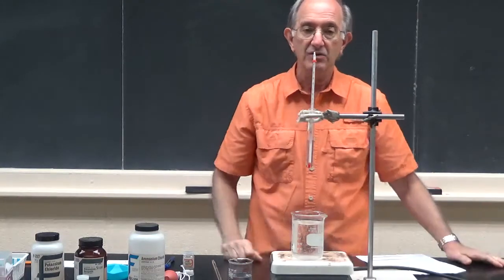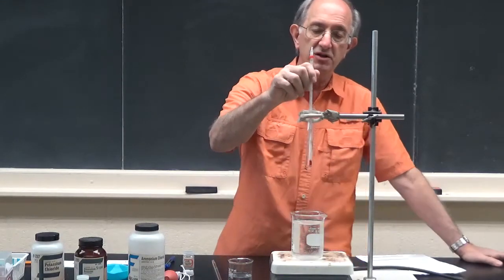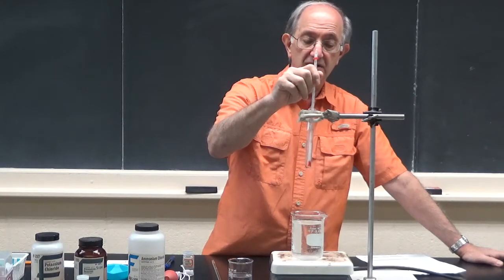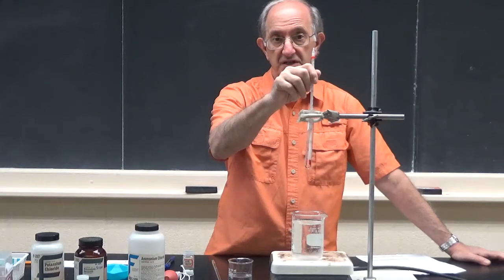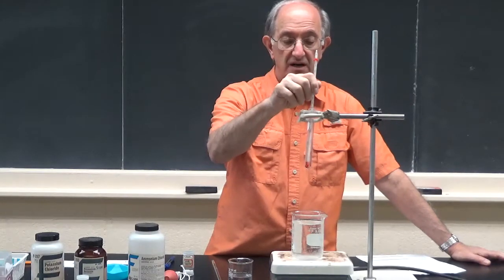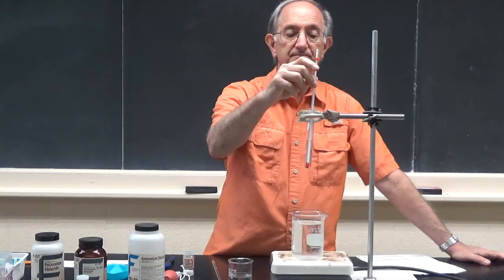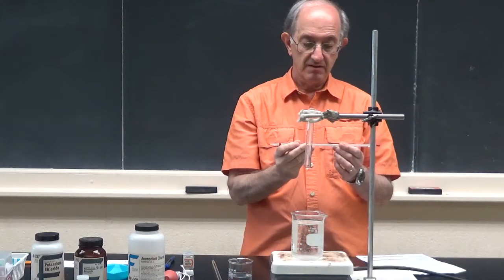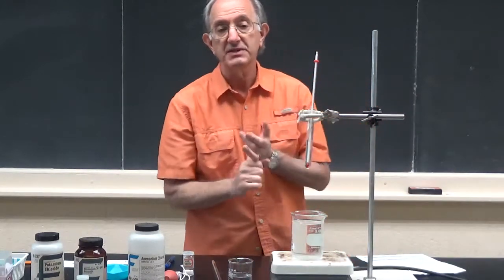You're then going to raise the test tube out of the boiling water bath, and you're going to continue to stir it until you see the first signs of a precipitate. You'll see solid, potassium chloride in this case, precipitating from the dissolved state. You'll see little faint particles. You're going to record the temperature using 3 significant figures, and that will be the precipitation temperature.